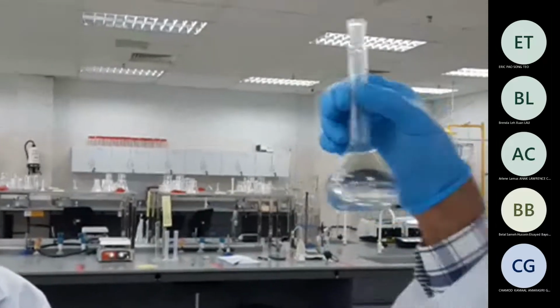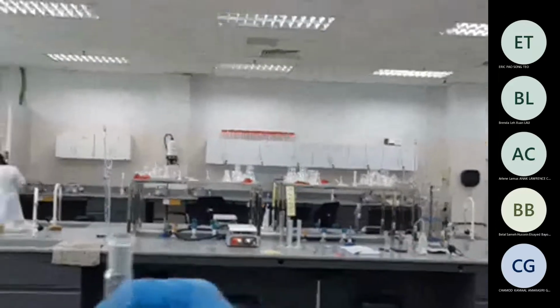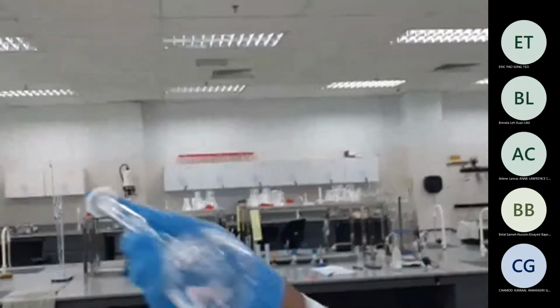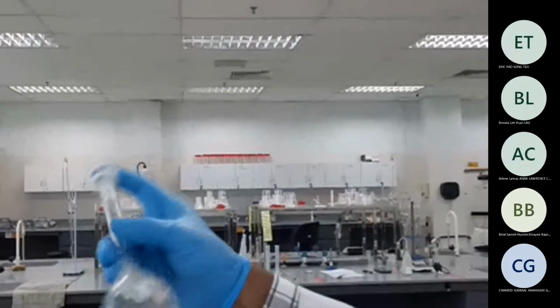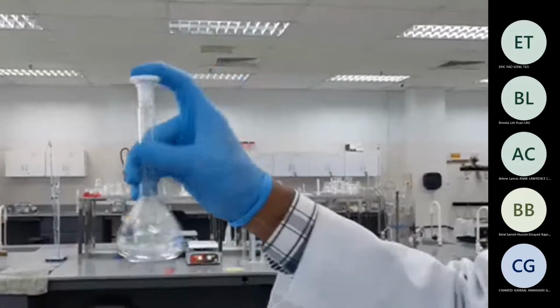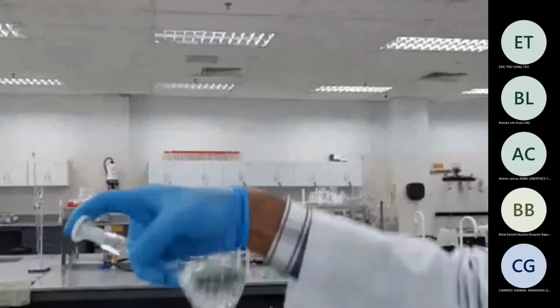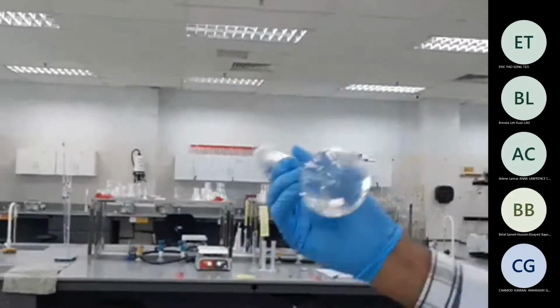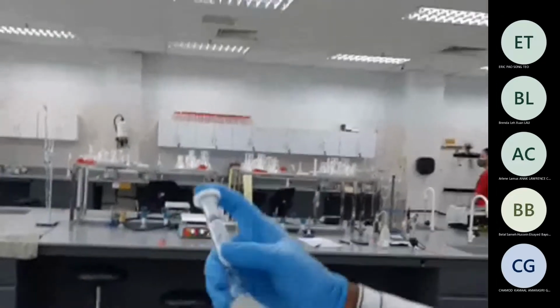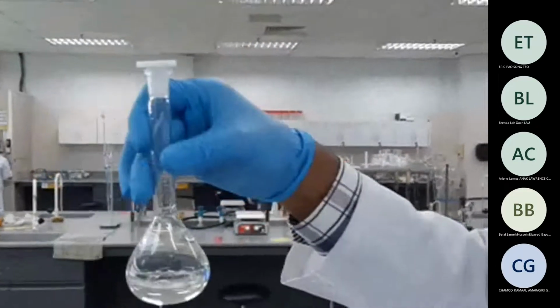Now I have to make sure that I mix it properly. Where is the cap? Give me the cap. I actually need 2 hands, but since I'm holding the phone, it's okay. So what we will do is, with the help of 2 hands, we should make sure that it mixes well, okay? Like this, with 2 hands, everything mixes well. And then here, we will try to add more water from the distilled water.